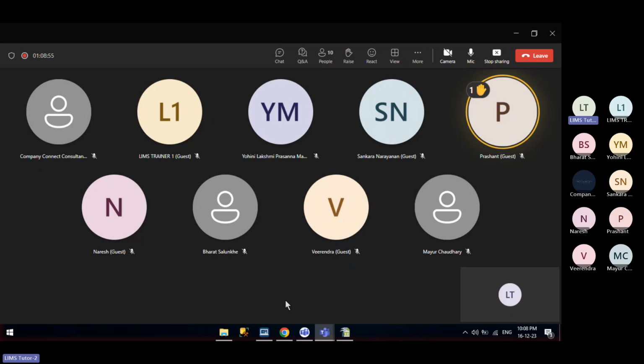Secondly, if any upgrade of the LIMS is being done, then there is no database transfer. The database will always remain where it is. The upgrade will be done on the existing database. LabWare will provide a patch, a setup, which needs to be executed on the LIMS system, and this patch will convert your LabWare LIMS from one version to another.